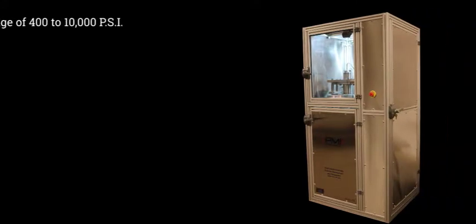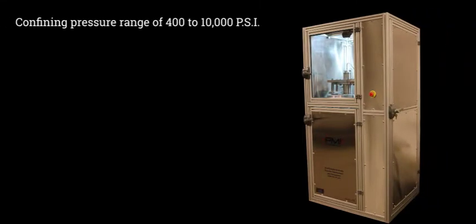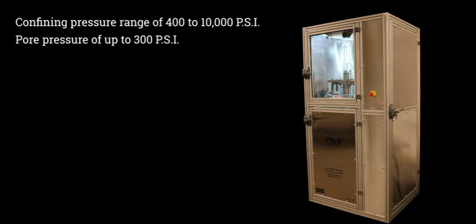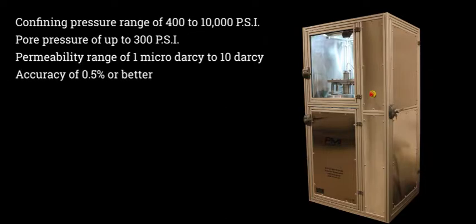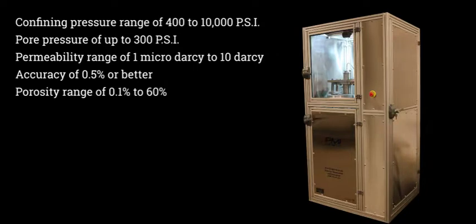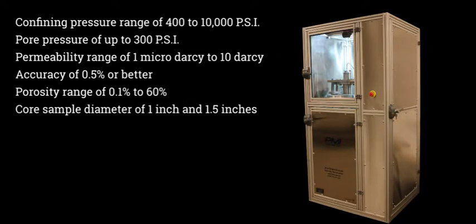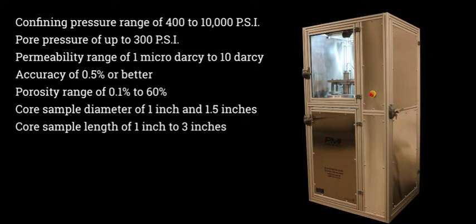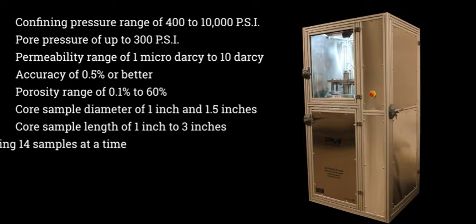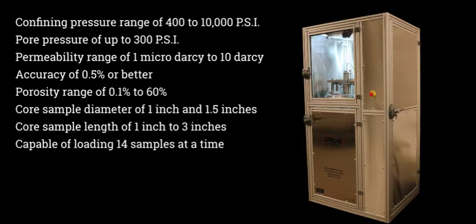Specifications provided in the machine include: a confining pressure range of 400 to 10,000 PSI, a pore pressure of up to 300 PSI, a permeability range of 1 micro darcy to 10 darcy, an accuracy of 0.5% or better, a porosity range of 0.1% to 60%, core sample diameter of 1 inch and 1.5 inches, core sample length of 1 inch to 3 inches, capable of loading 14 samples at a time.